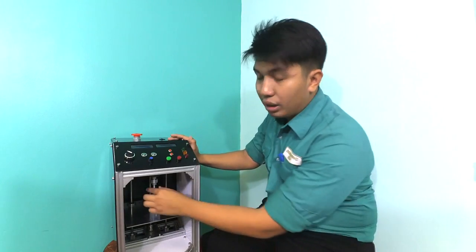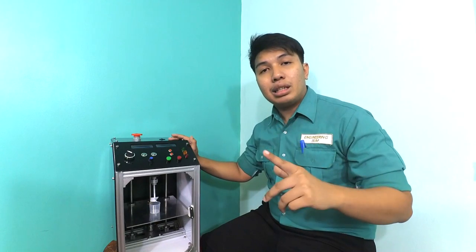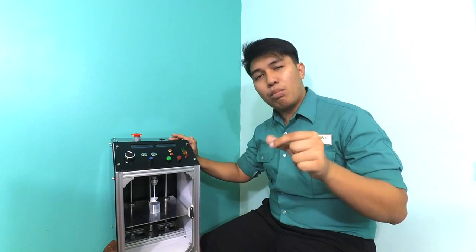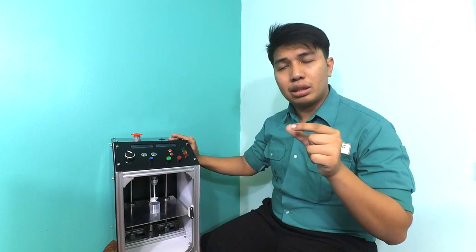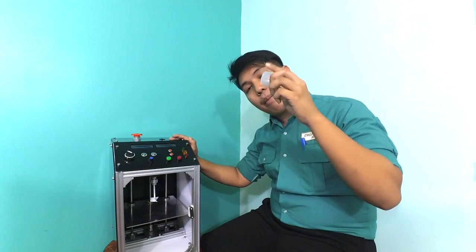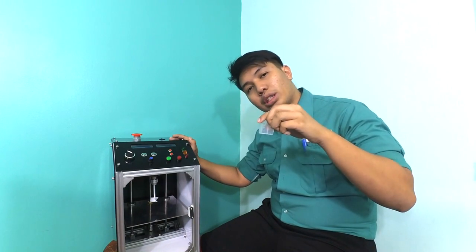This is a stirring machine which is able to mix and stir a small scale volume of mixture as low as 1 ml solution. Who can use this machine?